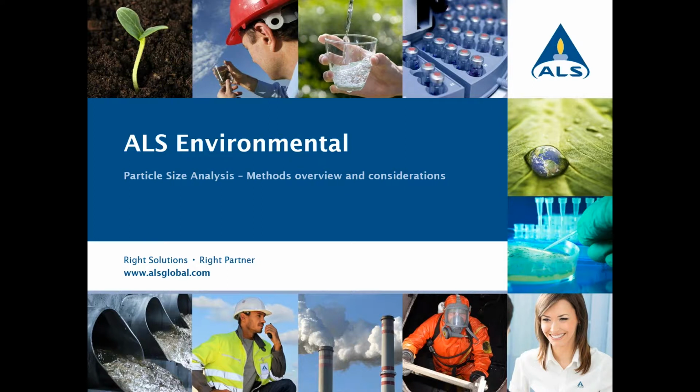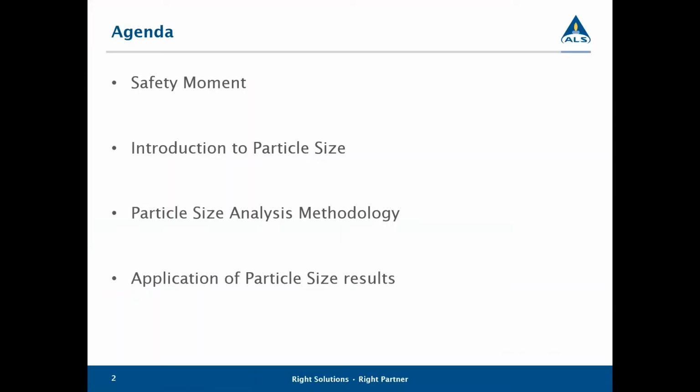So as Kelly said, I'm going to be speaking on particle size analysis. It's more of a method overview and considerations for clients of ALS. So just to start off with the agenda, as we start most of our presentations, with a safety moment, followed by an introduction into particle size analysis, a little bit into the methodology that we use in order to present the data to clients, and then some information about the application of the results.